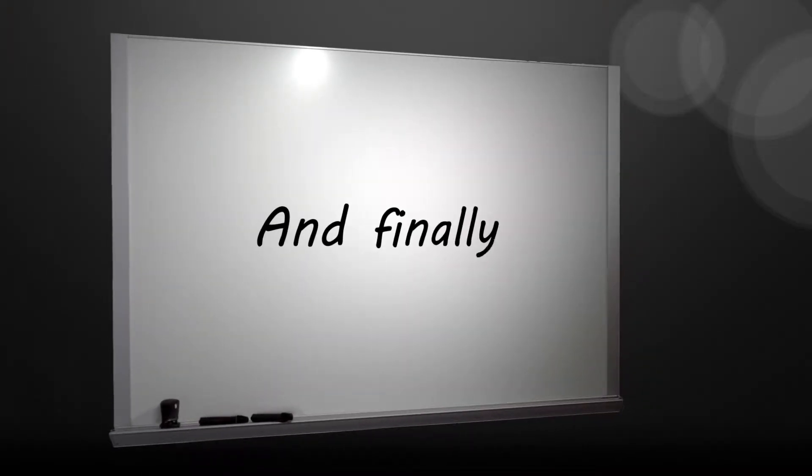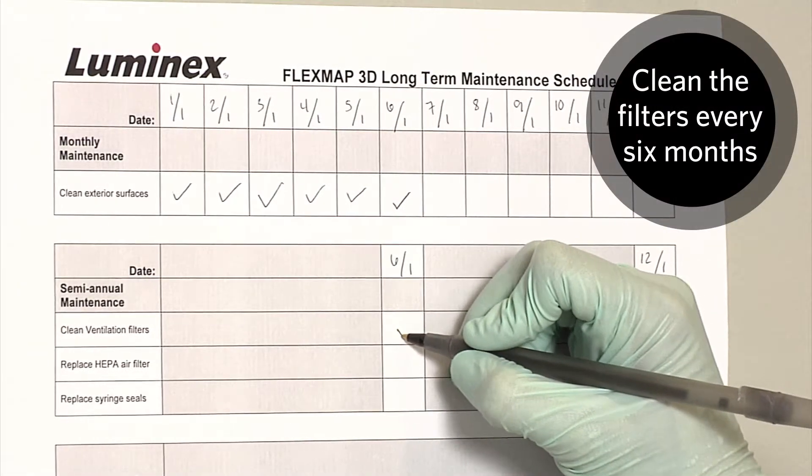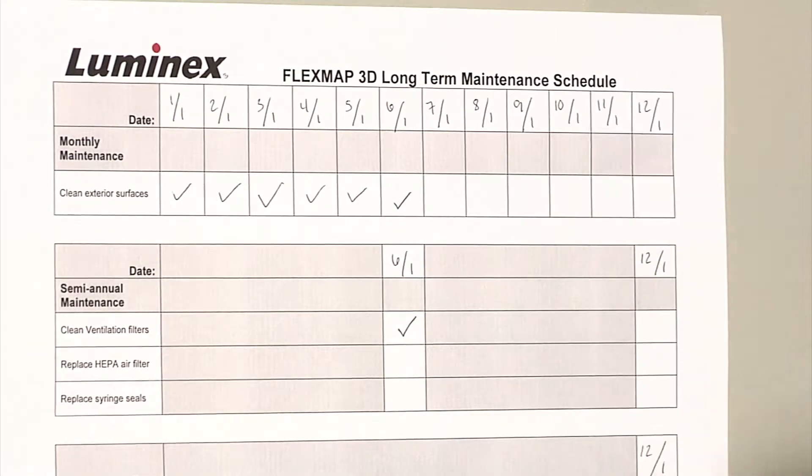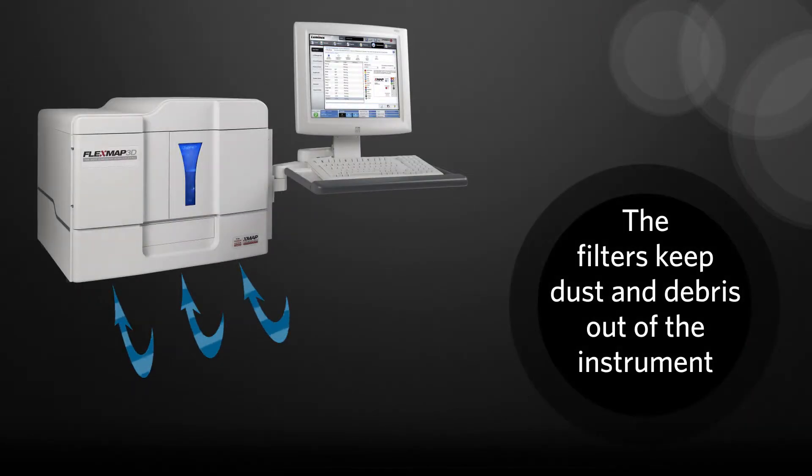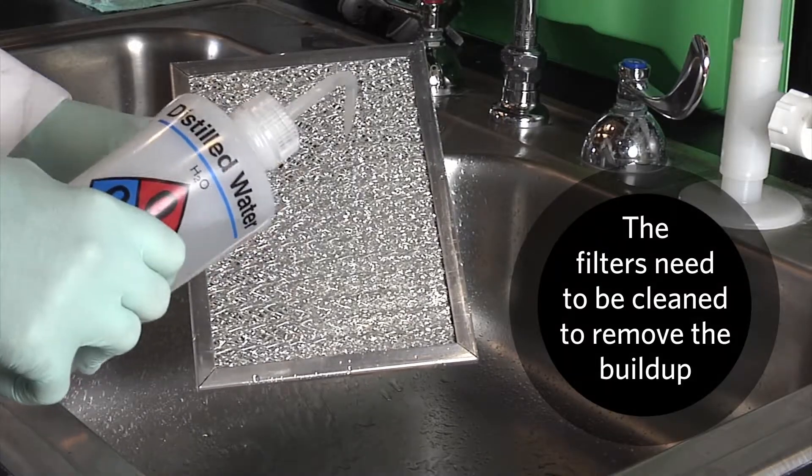And finally, remember... Cleaning the ventilation filters on the FlexMap 3D instrument needs to be completed every six months. These filters keep dust and debris out of the instrument. The filters need to be cleaned to remove the buildup.